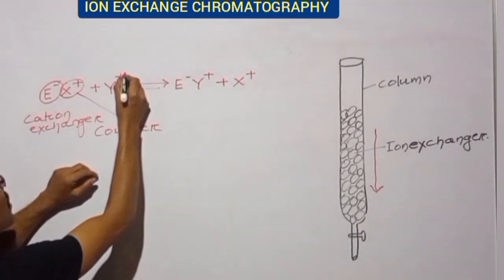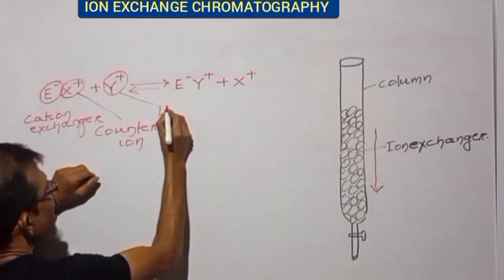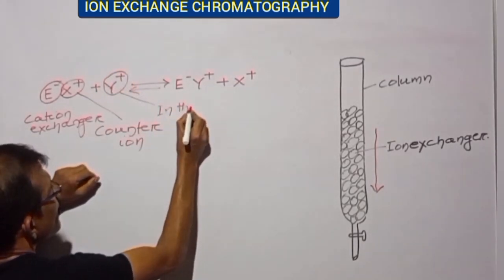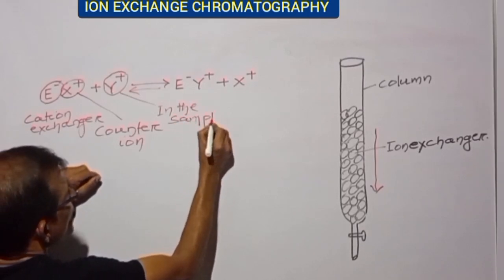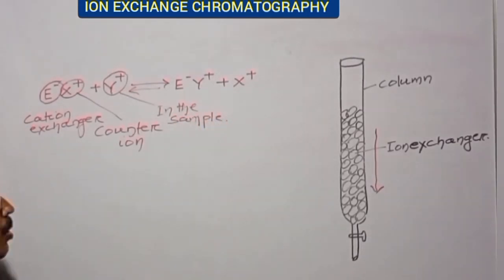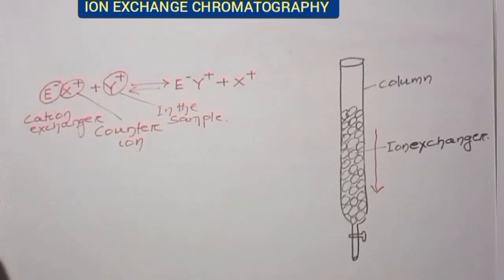Y plus is the charged compound present in the sample. We want to isolate Y plus from a mixture of compounds.